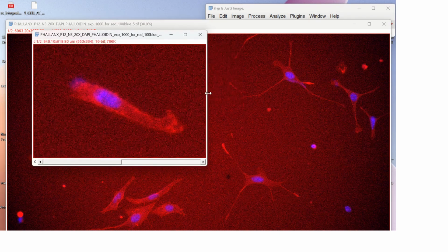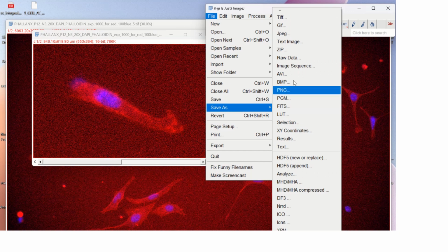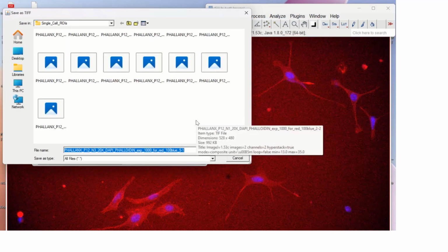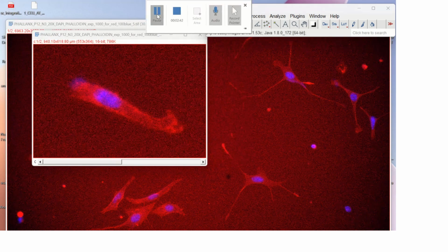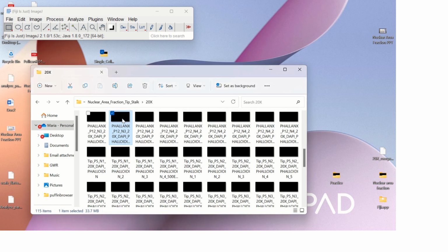So sometimes you can only get 2 or 3 cells in an image. Sometimes you can get like 10. So it just depends. So I always go to the bottom, click on that last one, and that'll remind me of where we are. So that was 3, now we're 4, and yeah. Okay, so I finished that image and I went ahead and closed it up. So now I'm going to the next image.